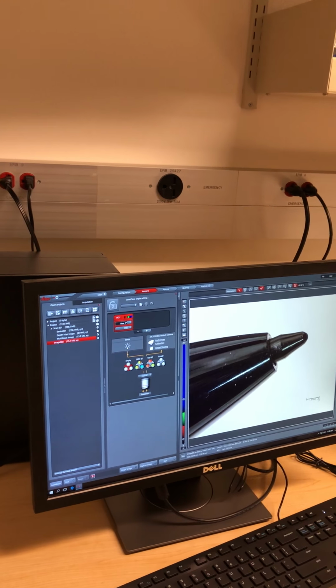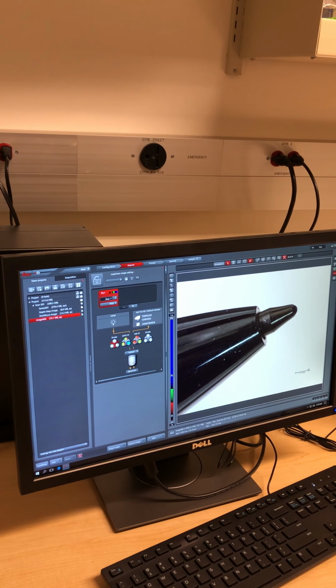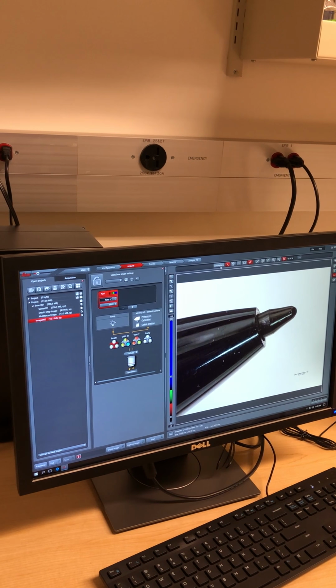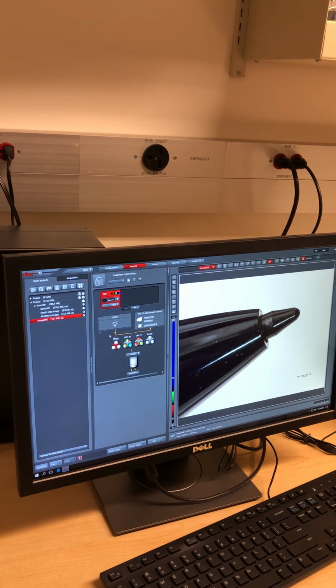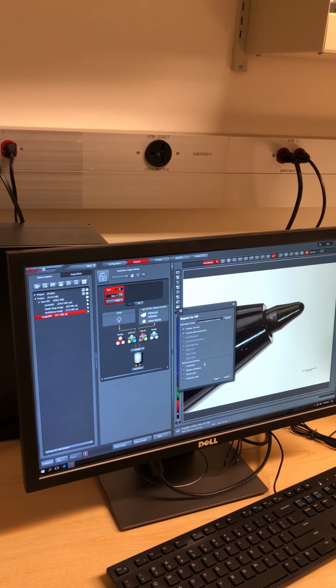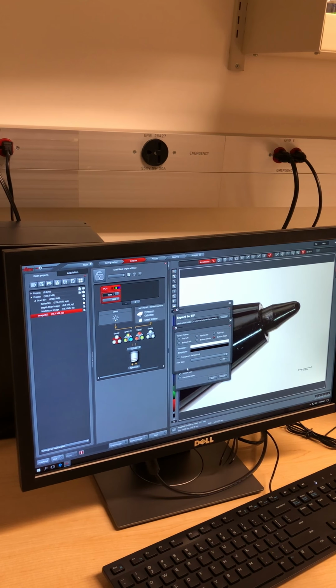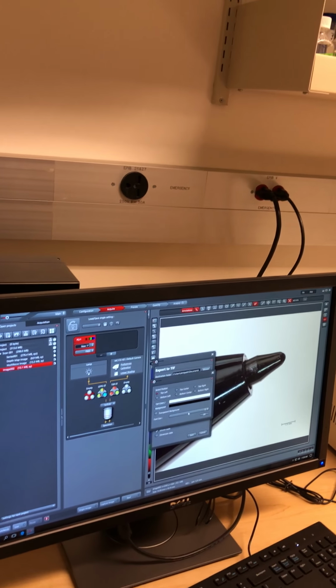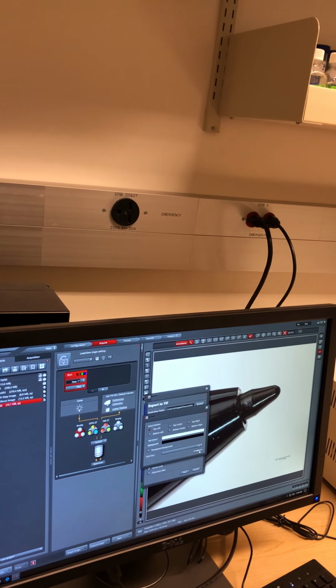And how do you burn it? What do you mean? So that if I make a TIFF, when you export, it's going to be on it's there, already burned in. It should be there anyway. Let's try it. I think it'll ask you if you want the micron scale. So it's a choice to leave it on there.